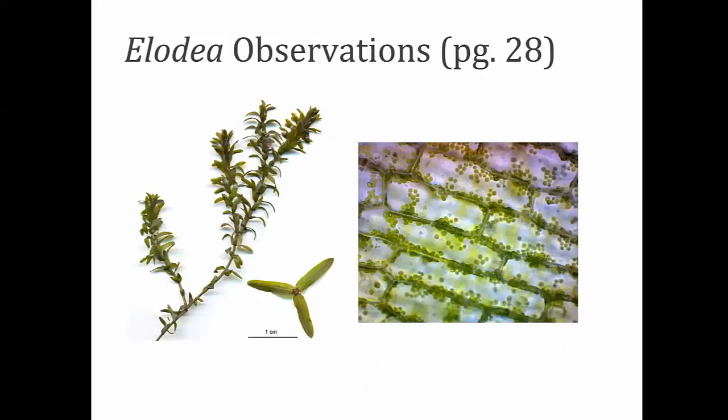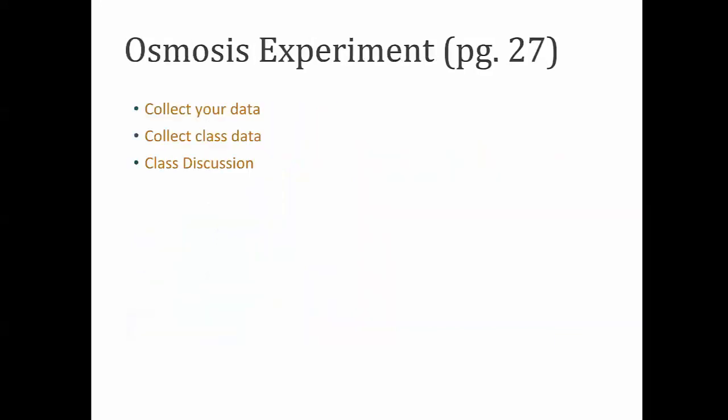So we're going to observe Elodea this week. I'll talk more about that in class, but it will be cool. You'll be able to see the cell walls. You'll be able to see the chloroplasts inside the cell, and we'll watch what happens when we put them in pure water versus very salty water. So what we'll do is we'll collect data, and then we'll discuss it at the end of lab, and you'll have an assignment to work on.